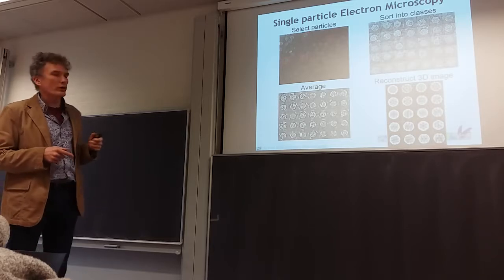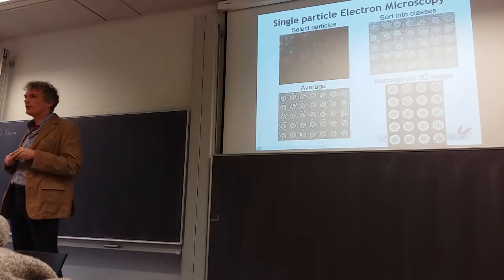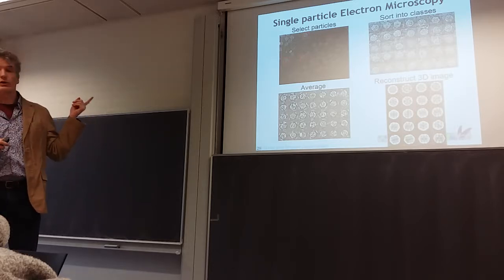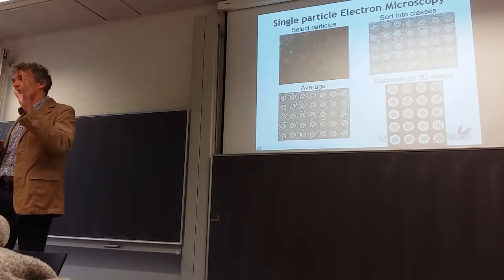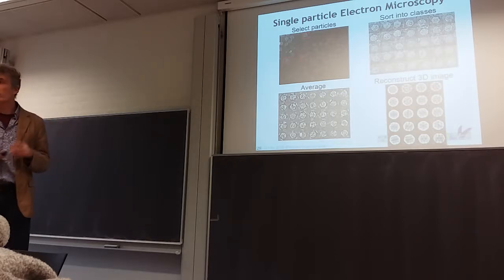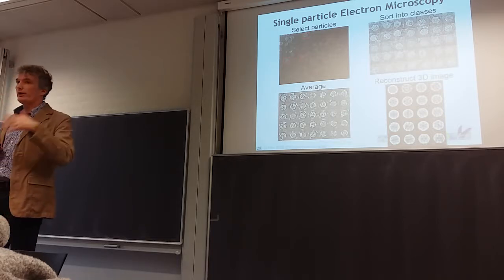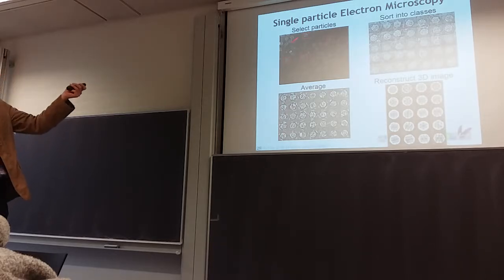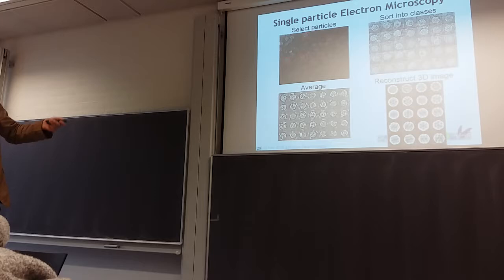This is quite old work that I couldn't trace back to the people who did it. I got this image from the people in Groningen when I was doing my PhD there. I don't remember who it was, and I couldn't find any papers they might have published on it. But it's a virus, and this is the raw image where you select different particles. You can sort of see them.